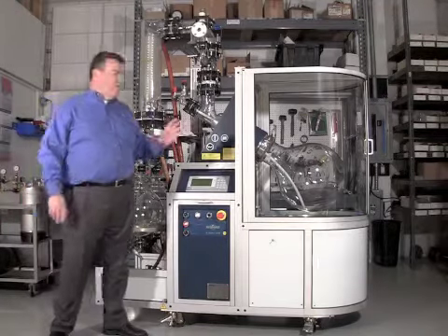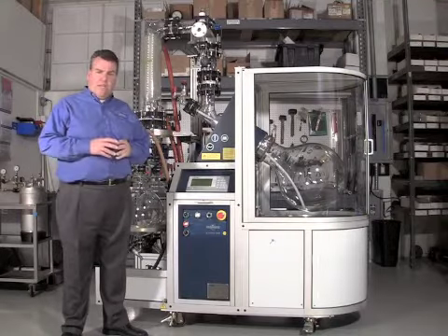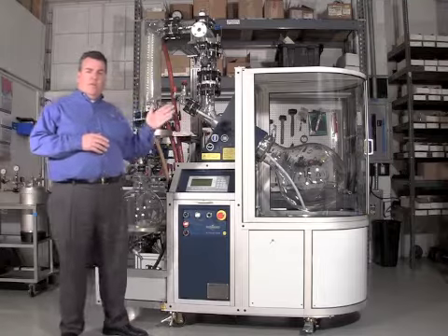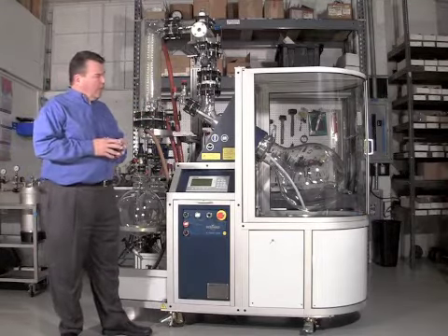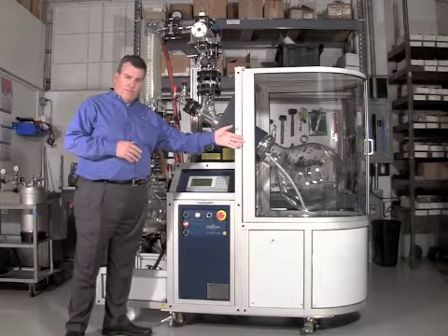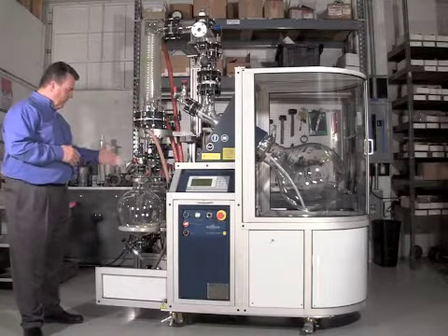I'd like to introduce the Styro-Glass Rotary Evaporator. This is one of the products that we represent here in the United States. This is a high safety rotary evaporator for industrial process chemistry. It consists of a 50-liter evaporation vessel, condensing unit, and receiver flasks.